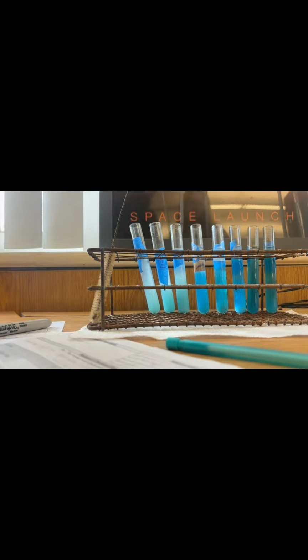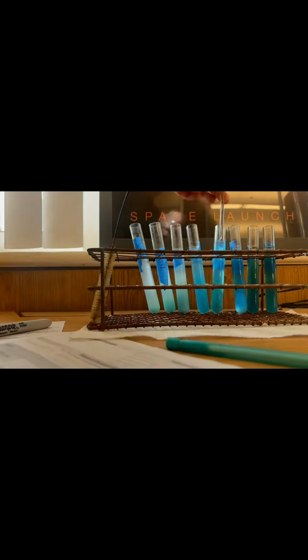After observing, we measured the height of each precipitate in each test tube to find these measurements. The graphs shown are the heights of the precipitates within the test tube. Notice how there is a gradual increase from test tube 1 to test tube 4, and then a gradual leveling off once you hit test tubes 5 through 8. To make it even clearer, here's a line graph showing the rise and the plateau. This is because of the limiting reactant.